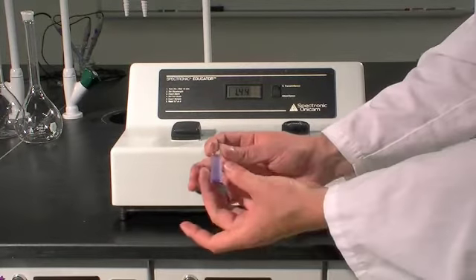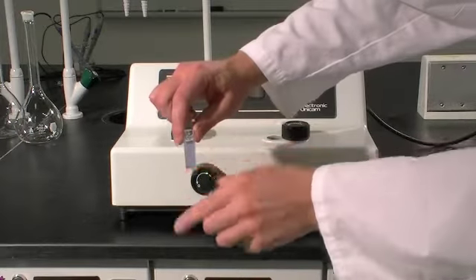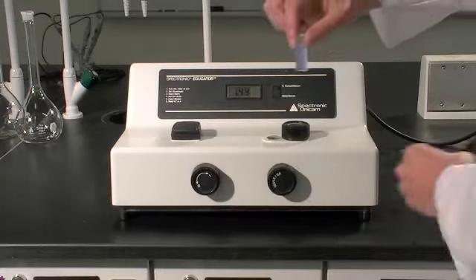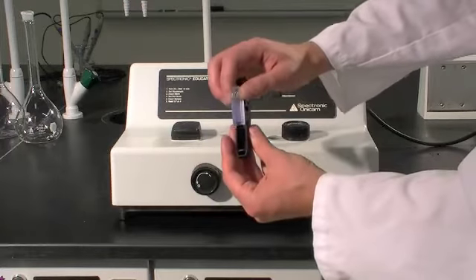The cuvette should be 3 quarters full. The cuvette has a clear side and a rough side. You're only going to want to be handling the rough side. Place the cuvette inside your holder with the clear side facing out.